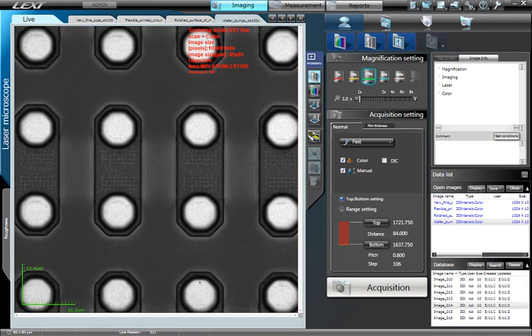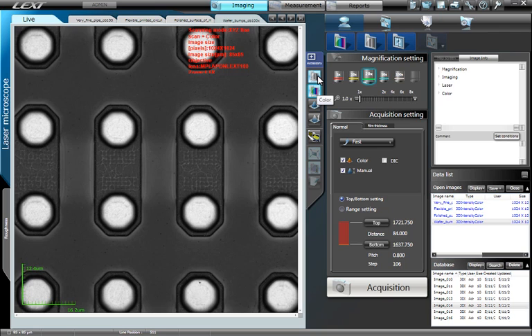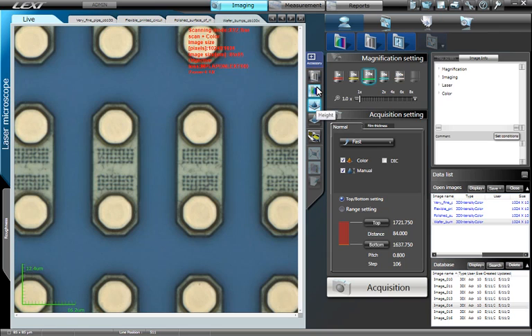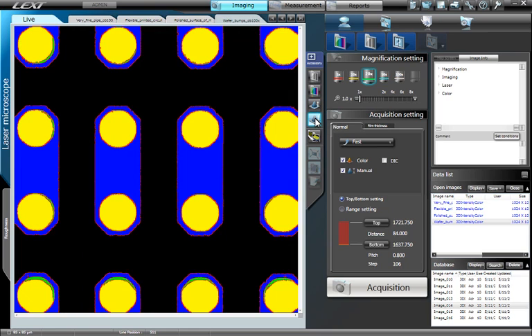After the image has been acquired, it can be visualized in many ways simply by clicking on the corresponding button on the right. Currently, the image is being viewed in 2D, 3D. The image can be visualized in laser intensity mode, color mode, height intensity mode, and contour mode.